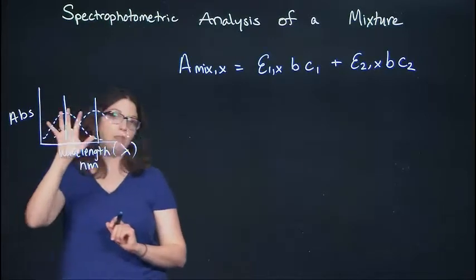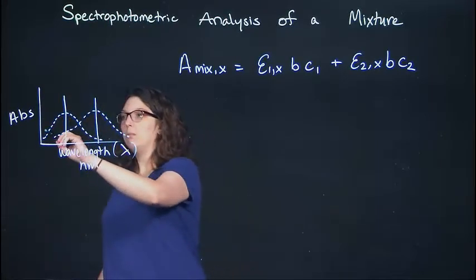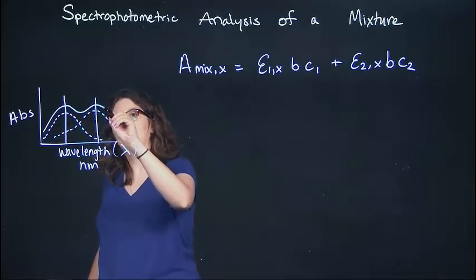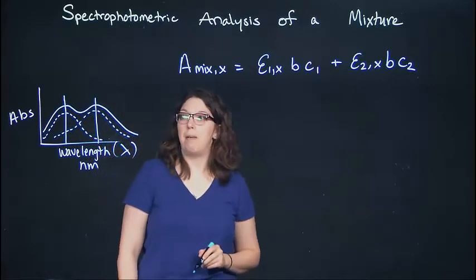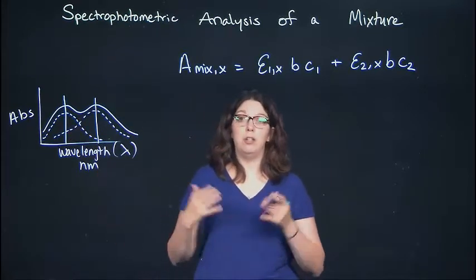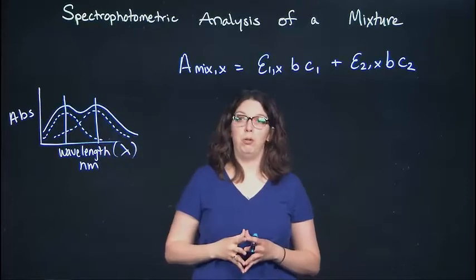So if these are our individual components, the absorption of a mixture, I'm going to offset it just a little bit, will look something like that. We'll have two peaks based on where the peaks are for the individual components in that mixture.